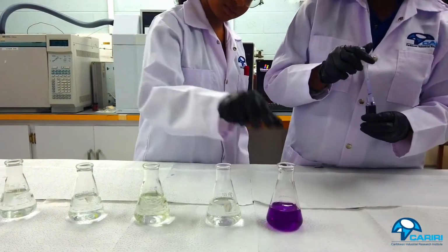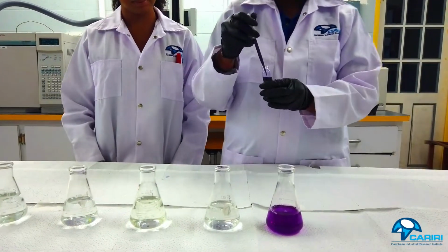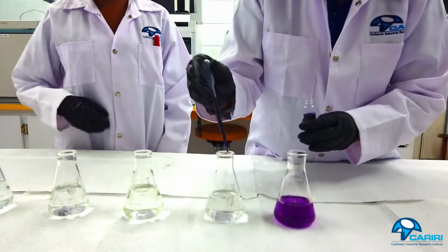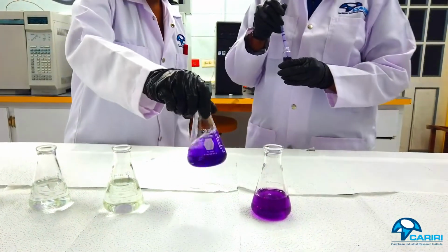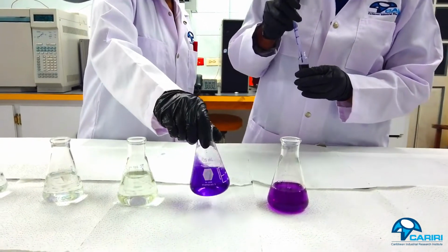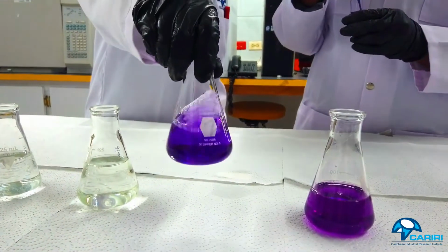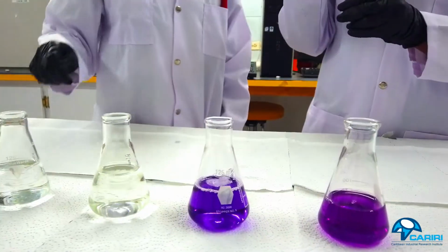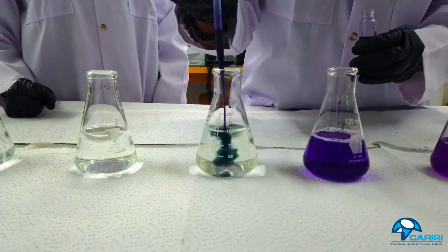And so we're seeing that this first conical flask remained purple. Let's go on to the second one and see what we get. Alright, so we've gotten a deeper purple color, but it still remains purple. And I'm going to tell you a little bit about what these color changes mean in a little while. So let's go to our third conical flask.